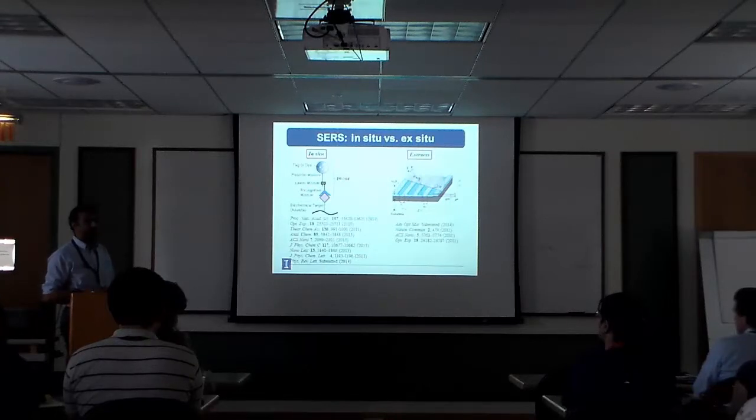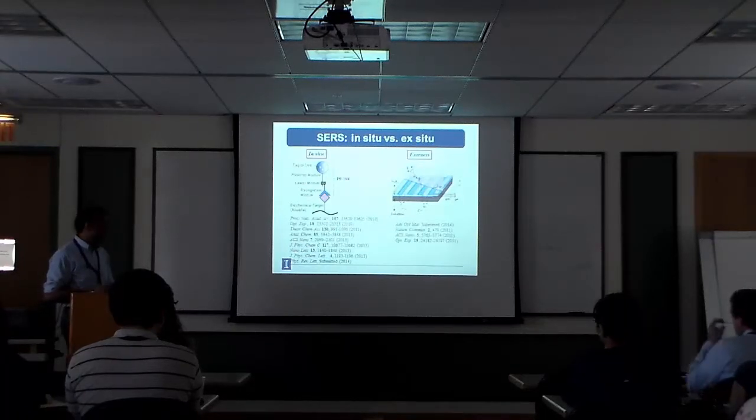This is, again, much easier said than done. We've spent a number of years doing this, but again, these are directions that you need to pursue. The track we've taken is that we hide all our sins of the nanoparticle in the way we do spectroscopy. Since we know how to do spectroscopy intelligently, we can design a nanoparticle that perhaps is not as good, but you can make use of it anyway in some clever ways. If you're interested, the references are there.